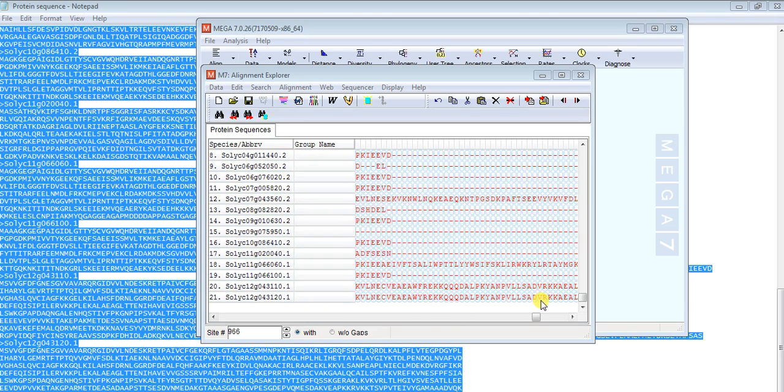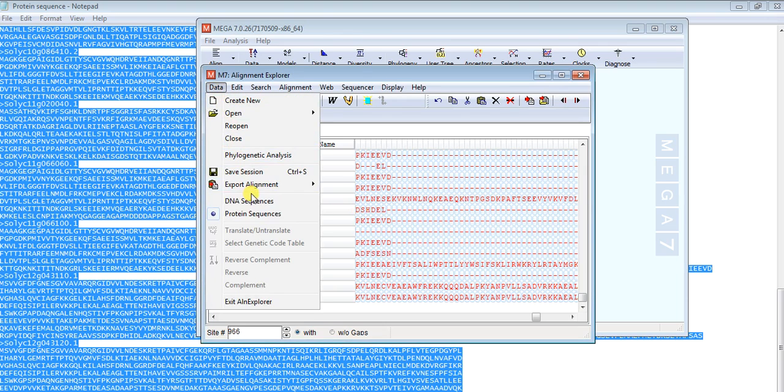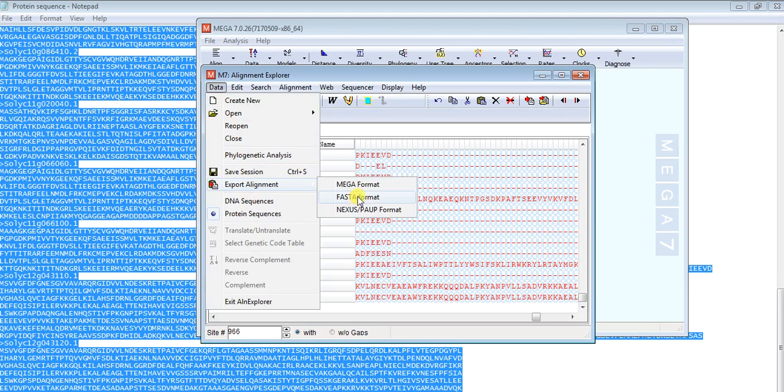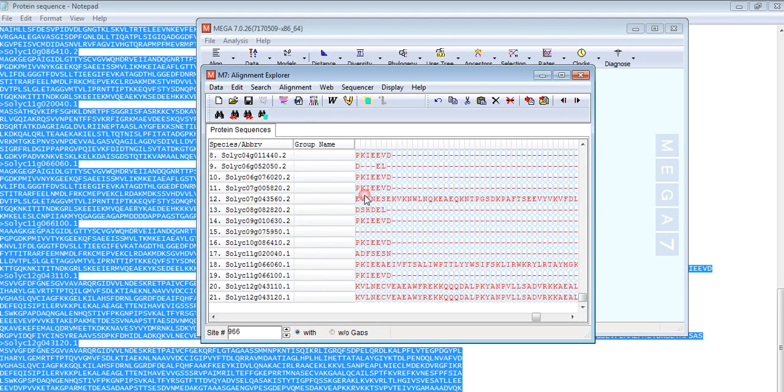Now the alignment is done. Save it into FASTA format. Go to data, export alignment, and FASTA format.